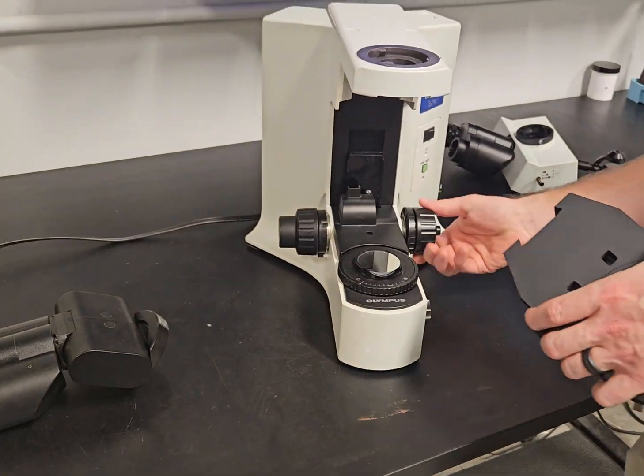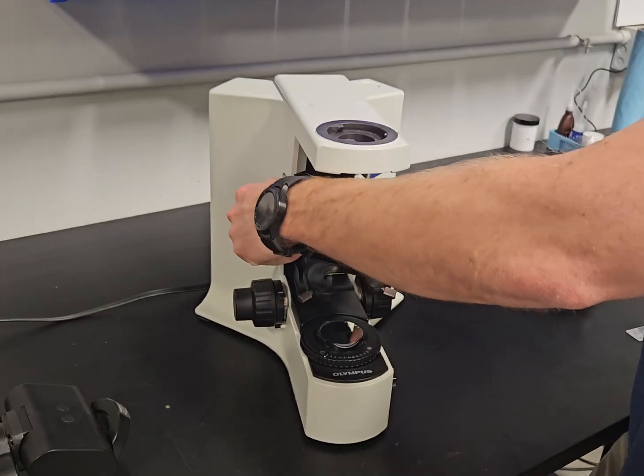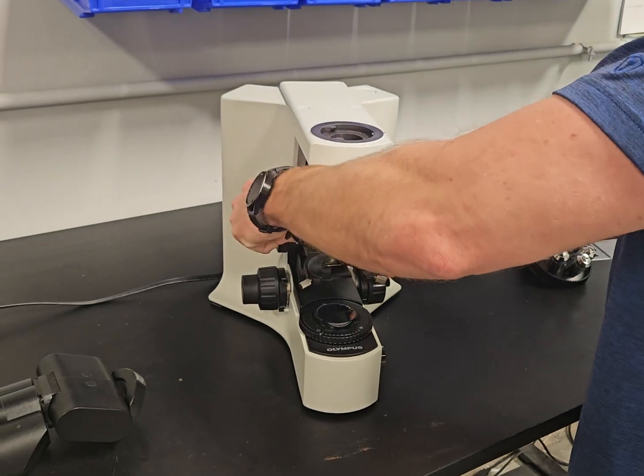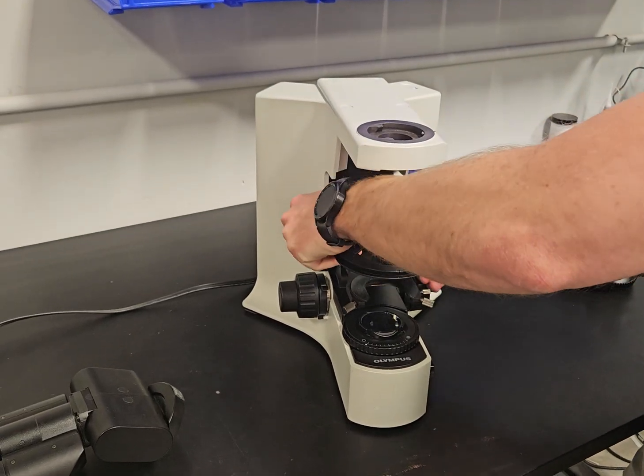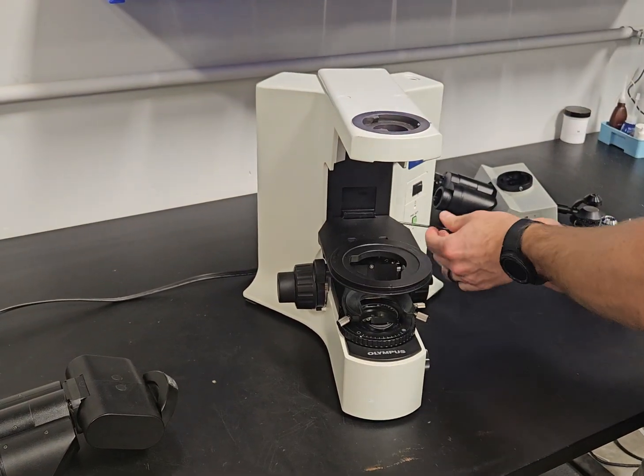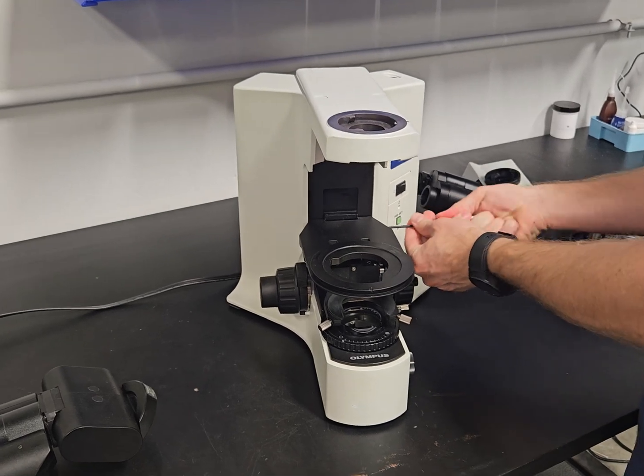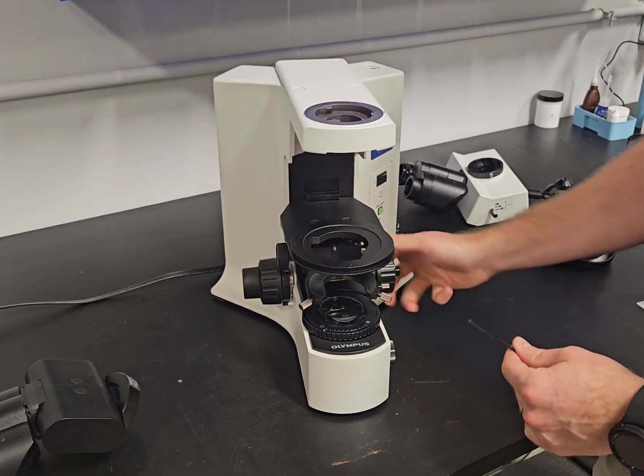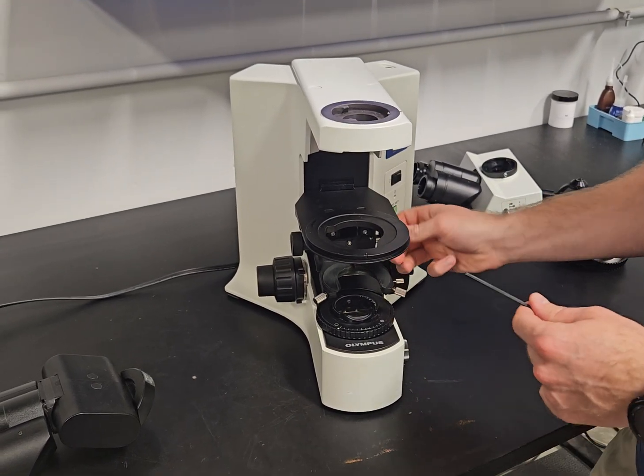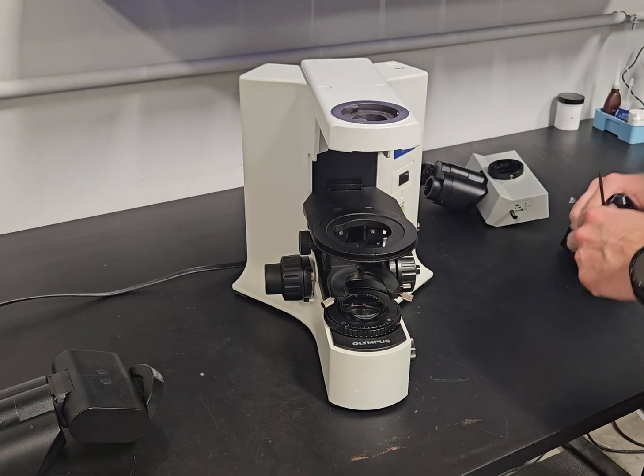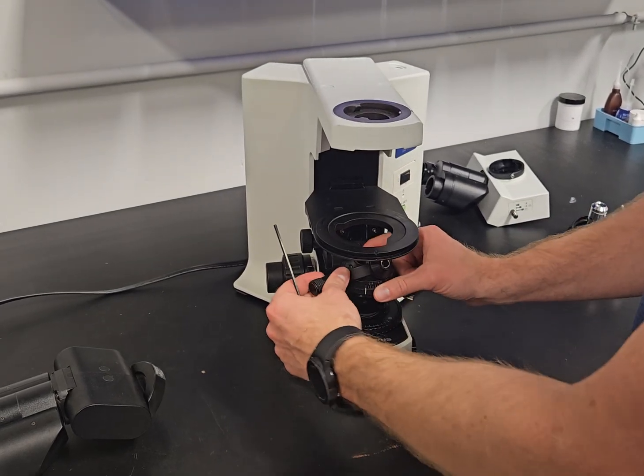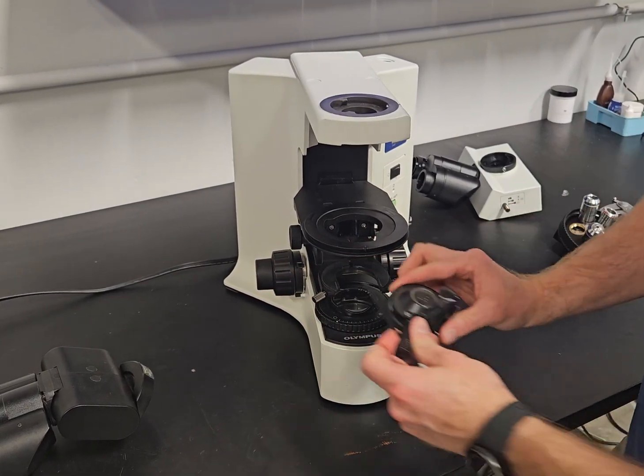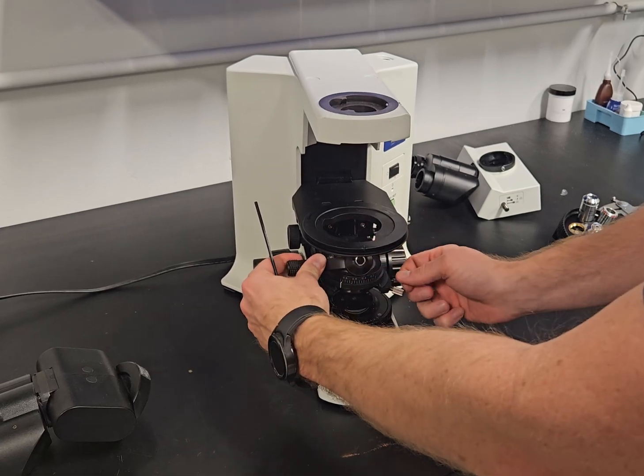We're going to put this thing back together and start off with the sub-stage. These scopes are awesome. This tool basically does everything that you want to do on the scope. You got a little stage pin right there that we're going to put in and rotate. You're going to see it click back.